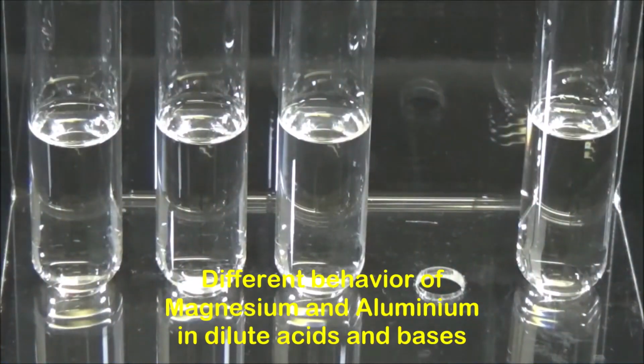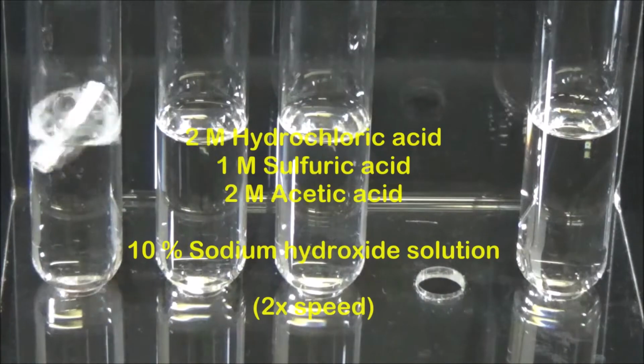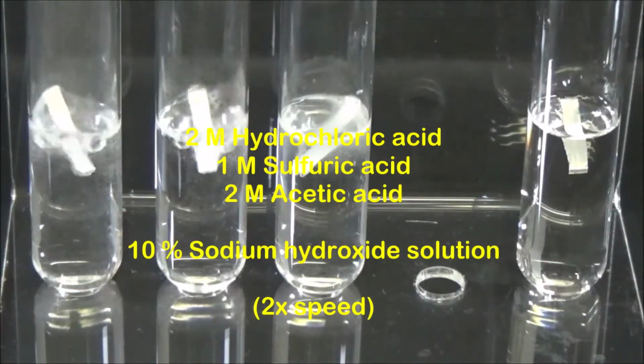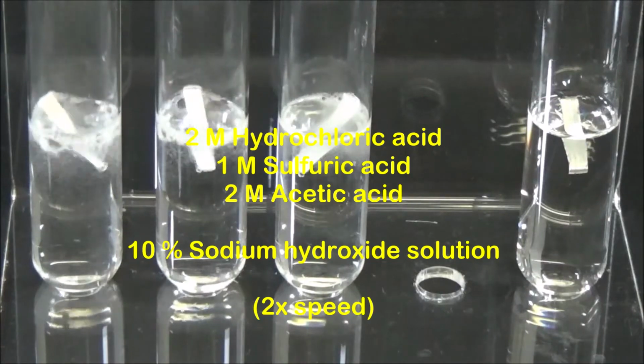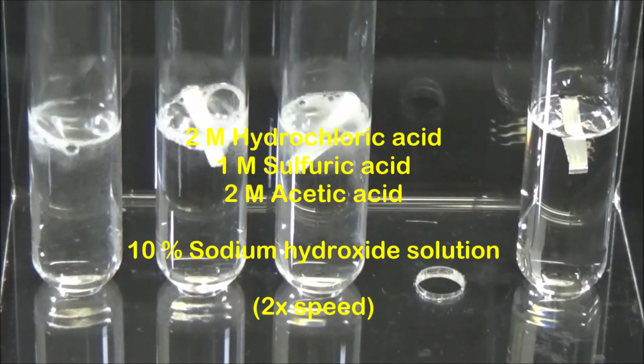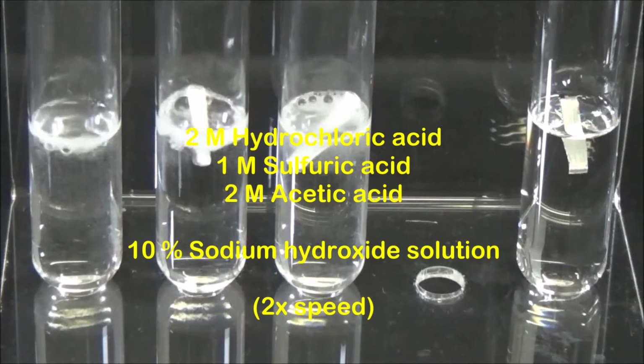Different behavior of magnesium and aluminum in dilute acids and bases. A piece of magnesium ribbon 2 cm long is placed in 10 ml each of 2 molar hydrochloric acid, 1 molar sulfuric acid, 2 molar acetic acid and 10% sodium hydroxide solution.